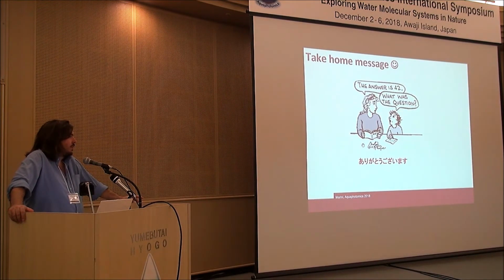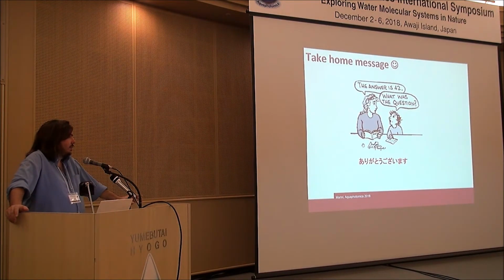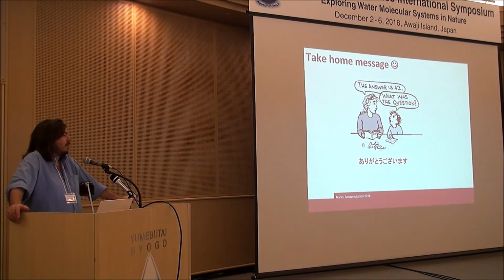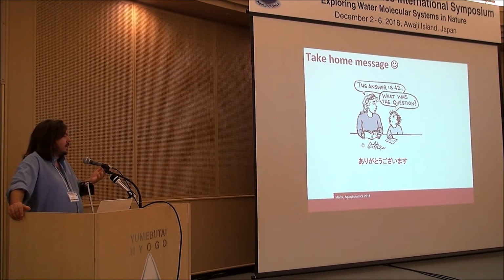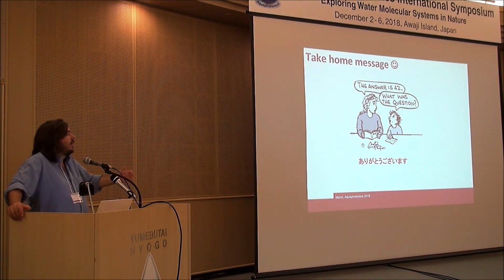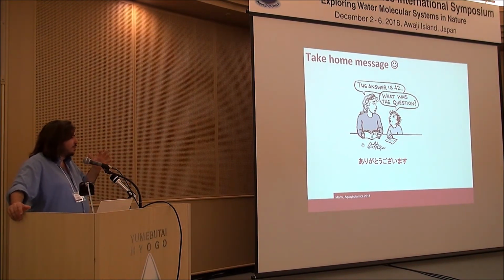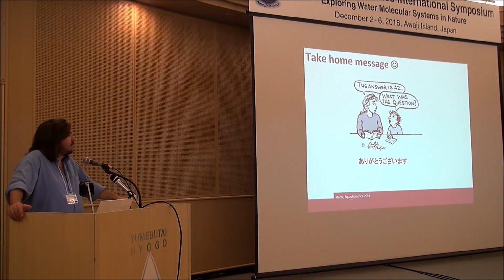Let's say that with 2 you explain 85–90% of variance, and with 3 you explain 97. But sometimes the problem is that with 3, 4, and 5 you explain 98.5, 98.9, and 98.99. And in some cases the spectral profiles are almost all reliable, and then it's difficult to decide.